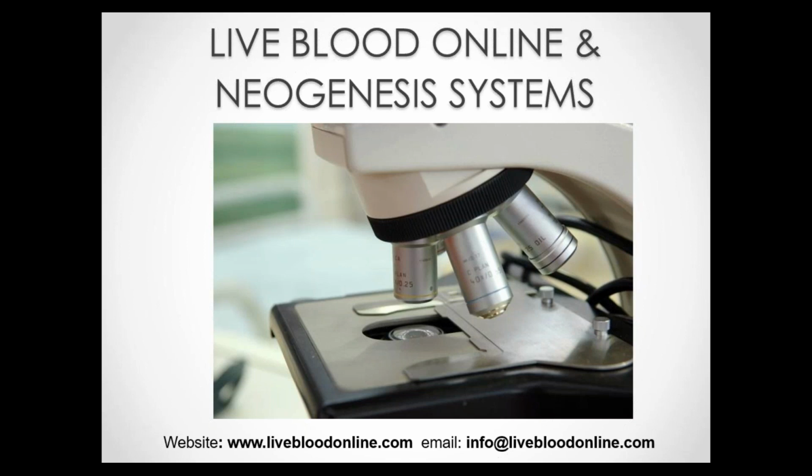Now, in essence, this is a nutritional test, so we can see various nutritional imbalances and other imbalances that can be addressed with changes in diet and lifestyle and specific natural treatment interventions. As I mentioned earlier, it's not really a tool used to diagnose medical diseases. The type of conditions that we're able to detect with live blood analysis are in fact conditions that are understood in the field of natural medicine and not completely accepted in the field of conventional medicine.